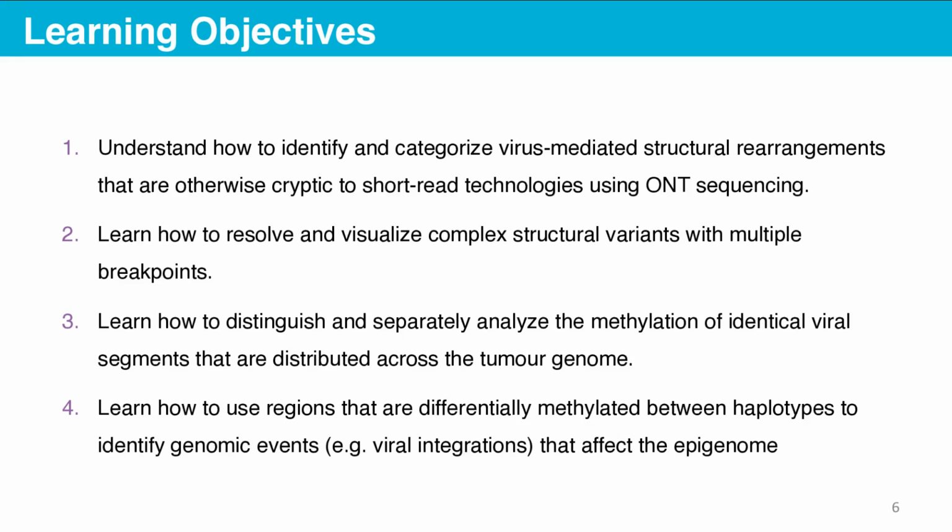So the learning objectives of this webinar are first to understand how to identify and categorize the virus-mediated structural rearrangements that are often otherwise cryptic to short-read technologies using nanopore technology. And then second, learn how to resolve and visualize complex structural variants with multiple breakpoints.